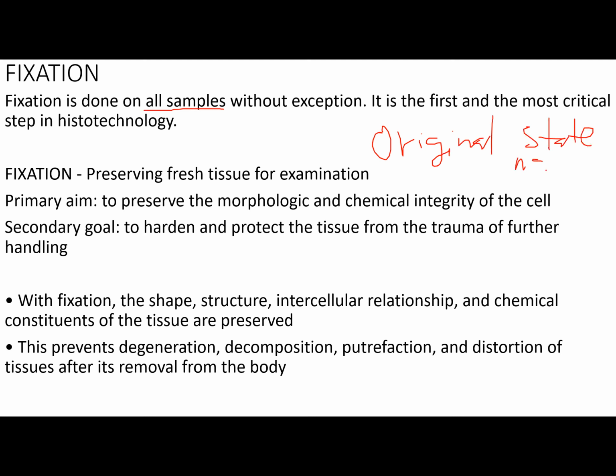ng cells and ng tissues of your sample organ. By doing that, class, you would have an accurate, or yung mga pathologists would have an accurate description or an accurate identity on what type of disorder the patient has.